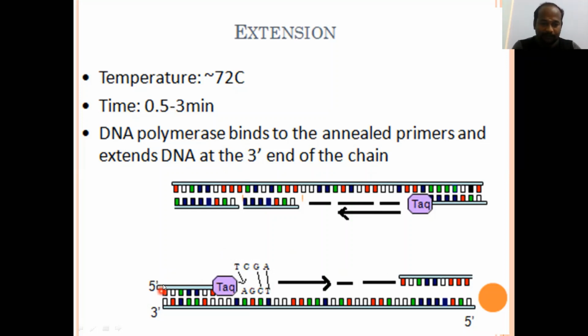In this case, the primer is attached already during the annealing process. There is a Thermus aquaticus DNA polymerase enzyme. It is helping the primer elongation or extension process. During this stage, there will be an addition of dNTPs, nucleotide bases of the DNA fragment. During this addition, this DNA polymerase will help the attachment of dNTPs with the complementary DNA sequence.